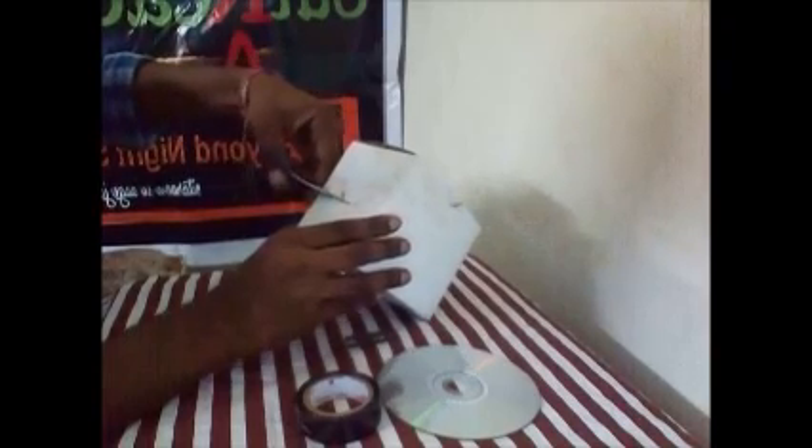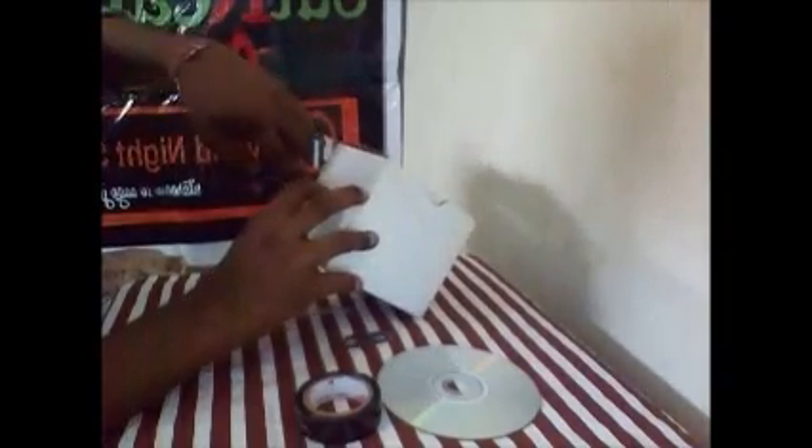Coming to the making of the slit. The slit is a very important part while making a spectrometer — the quality of the slit will determine the quality of the spectrum. We will make a rectangular portion in our box to make the slit. Try to make this slot as small as possible. To make the rectangular portion edges sharp we will be using a blade.